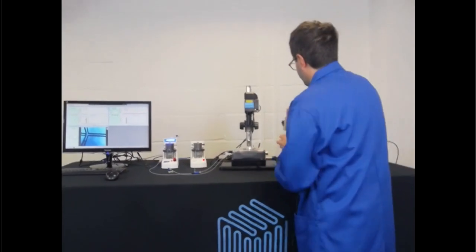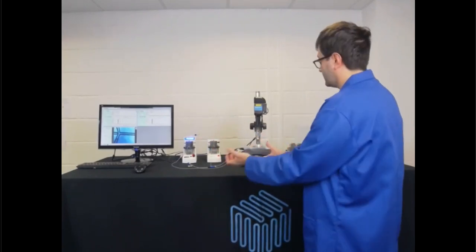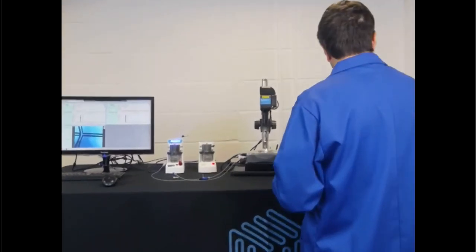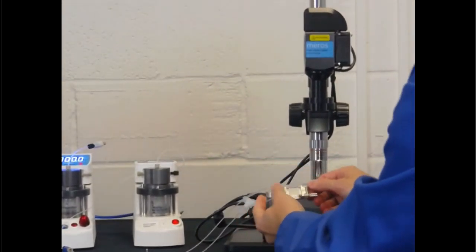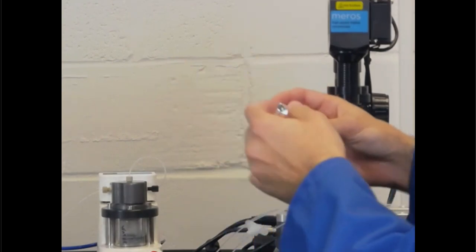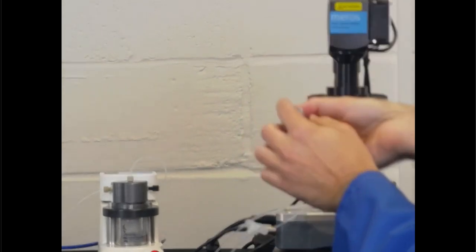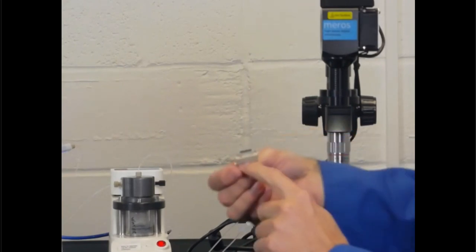The system that is here is the standard R&D system, and the extra bits that I show you afterwards are sort of upgrade parts that we can add on top of this. The glass microfluidic chip is placed within an H interface, which is this one. The tubing is connected using those linear connectors. It's kind of difficult to see on the camera, but basically there are holes and then there is a gasket on the other side. You can insert the tubing from this side and then align the tubing with the gasket on this linear connector, and then the same on the other linear connector.